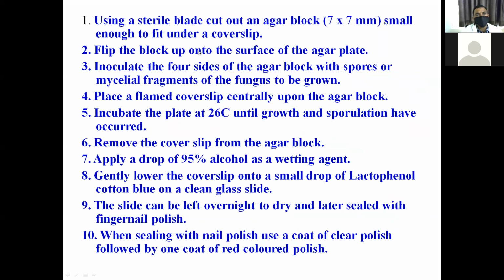Steps: using a sterile blade, cut an agar block, maybe Sabouraud dextrose agar, 7 into 7 mm, small enough to fit under the cover slip. Whatever size fits the cover slip, that much media we have to cut. Using a sterile blade, cut it small enough to fit under the cover slip.